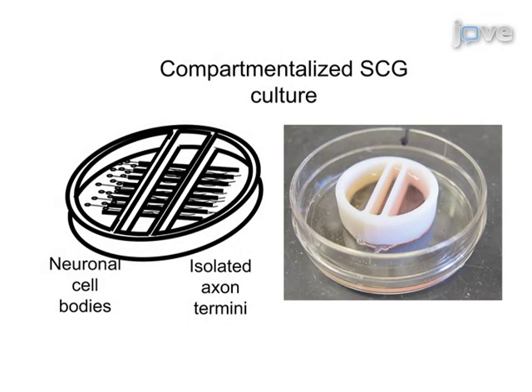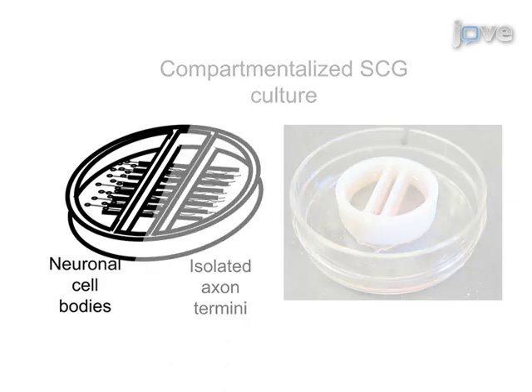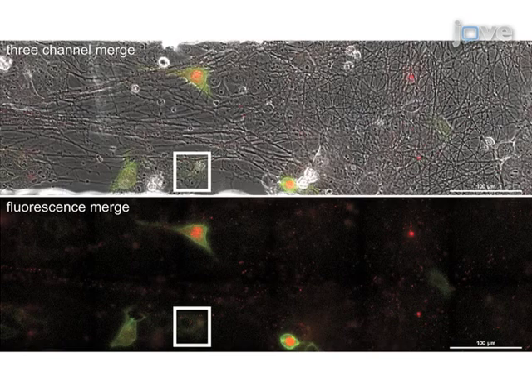Here, a schematic of the compartmentalized culture system pictured in this image, with SCG neurons plated in the left compartment and with axonal projections extending beneath the internal barriers into the far right compartment, is shown. The following images were selected from a large image tiled time-lapse movie of virion transmission from PRV427 infected axons into recipient epithelial cells.